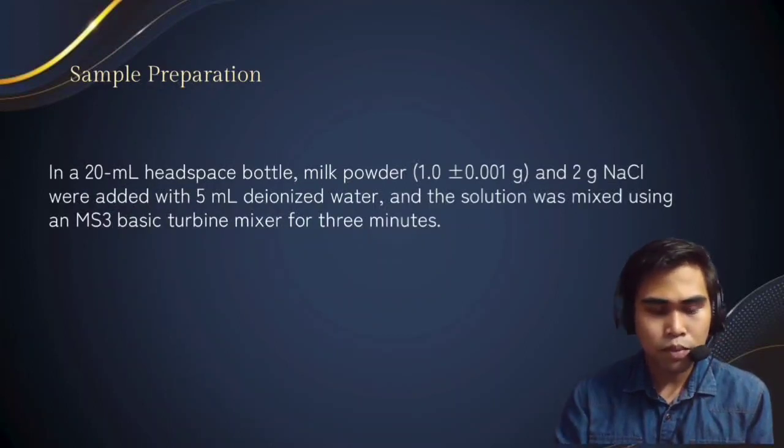Sample preparation. In a 20 ml headspace bottle, milk powder 1.0 plus or minus 0.001 gram and 2 gram sodium chloride were added with 5 ml deionized water, and the solution was mixed using an MS3 basic turbine mixer for 3 minutes.